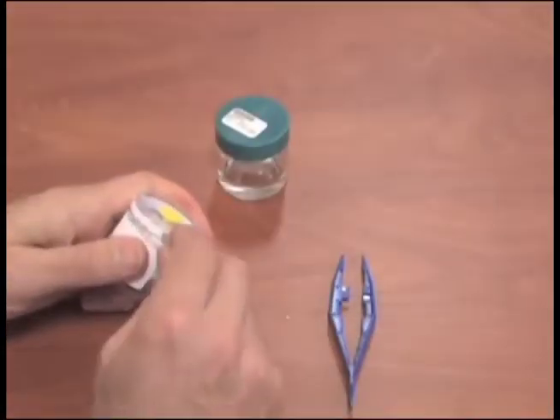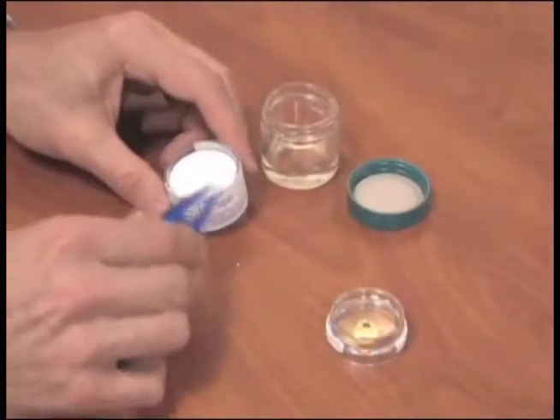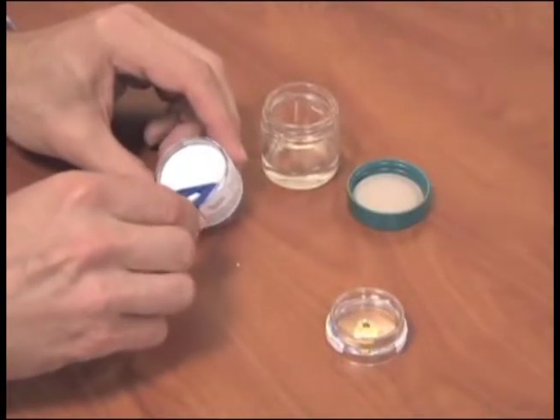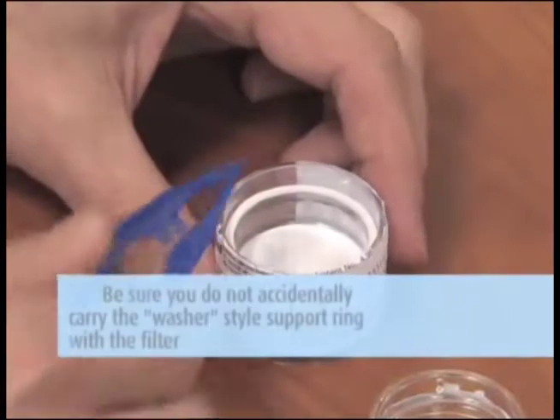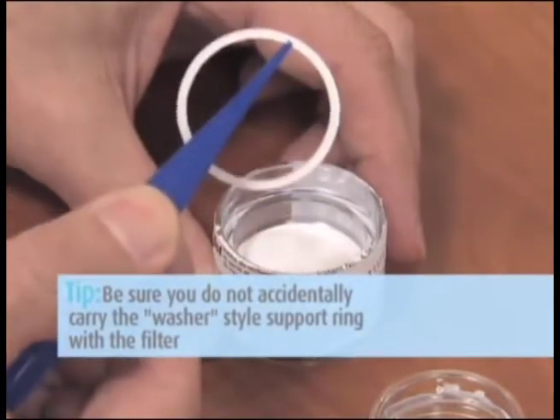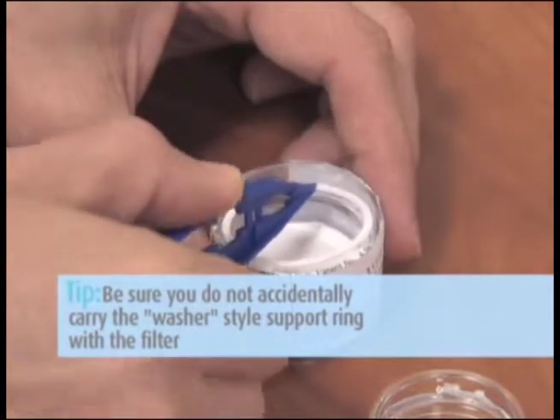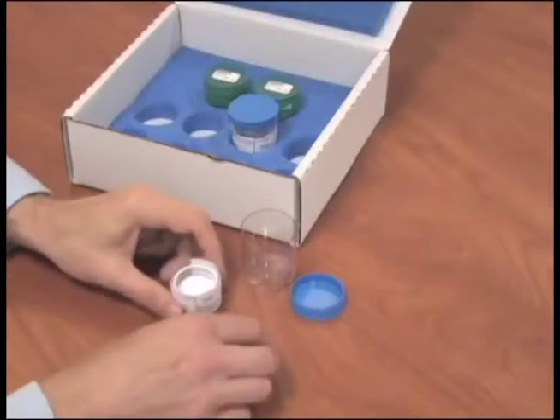Remove the top section of the cassette using a cassette opener or screwdriver. Using tweezers, remove the top Teflon filter and place the filter into the jar containing MOPIP solution. Tip: be sure you do not accidentally carry the washer-style support ring with the filter. Leave the bottom fiberglass filter and the support ring in the cassette.